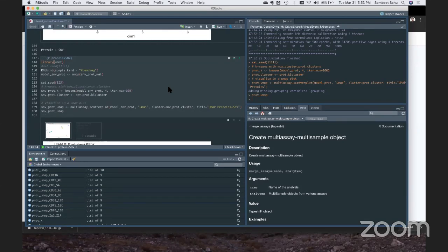You could play around with your filter if you want to be more stringent and want cells which are more complete, in the sense that all of the amplicons have reads. So for this data set, based on the filtering, that would change what is being processed downstream.